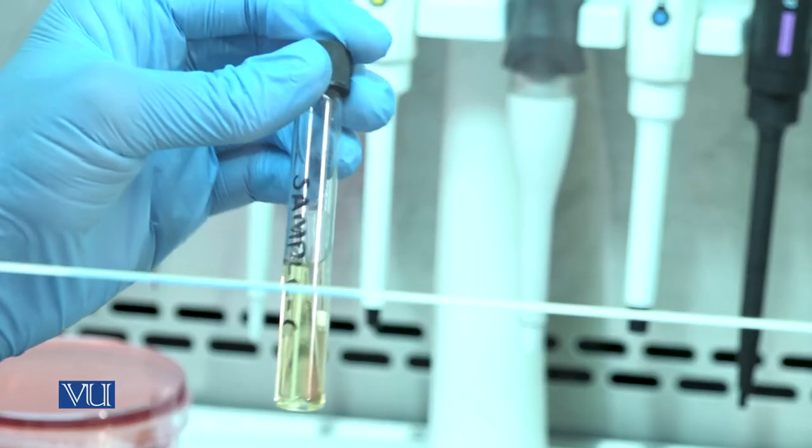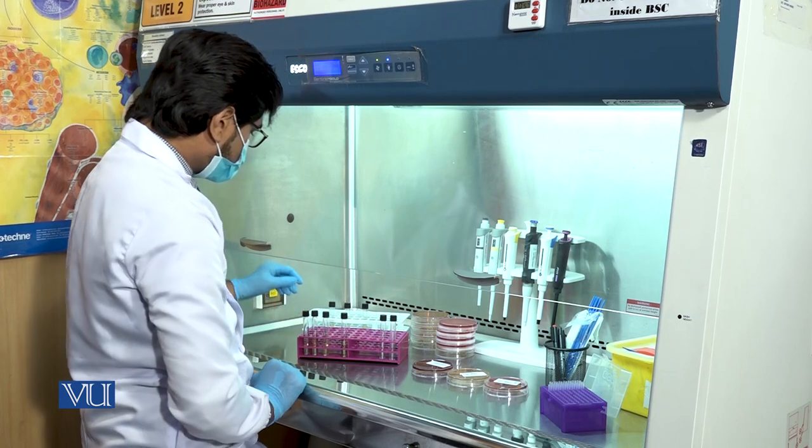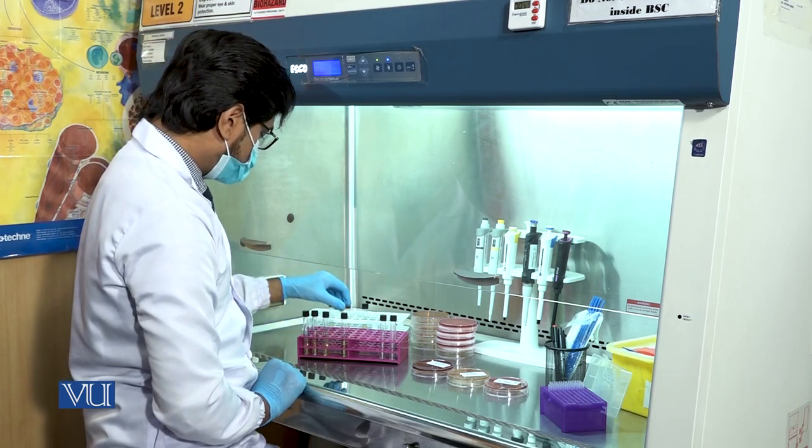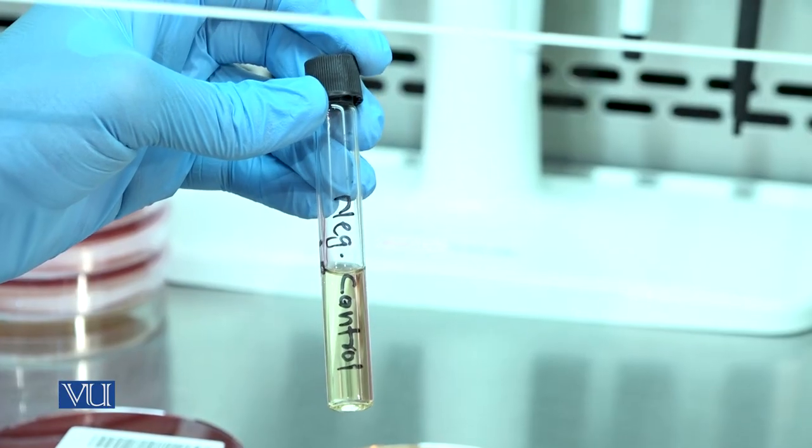Make sure to label the details of the sample on the tube before culturing. Also make sure to have a separate tube of liquid media without any bacterial sample, which would be labeled as negative control.